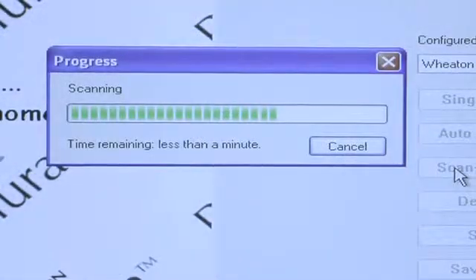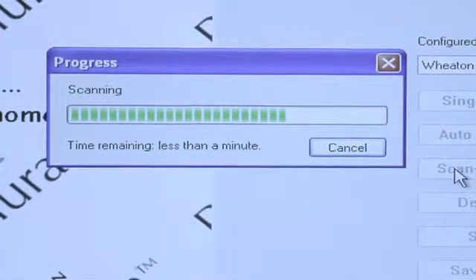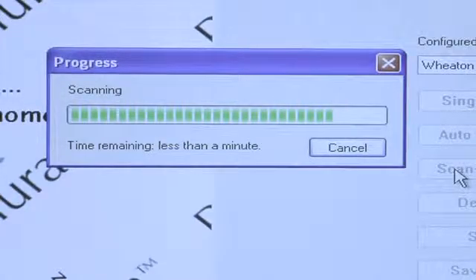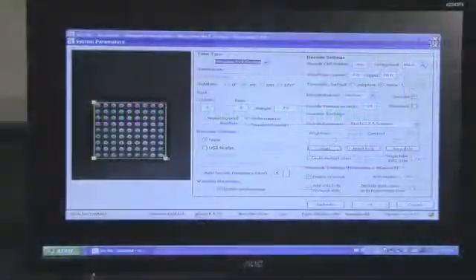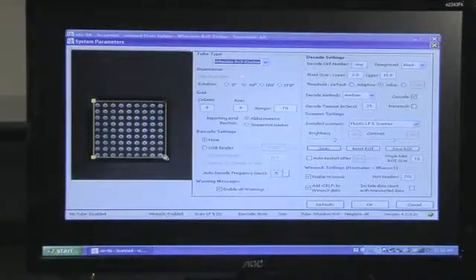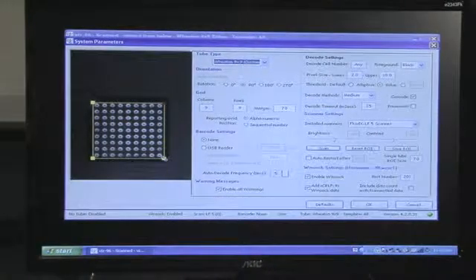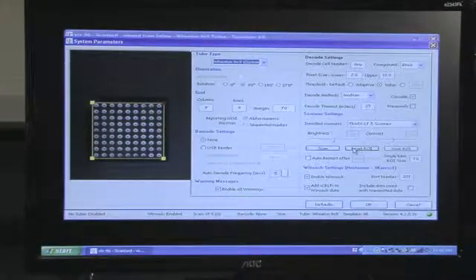The Wheaton Pluriscan will then perform a preliminary scan of the vials in the rack. Using your cursor, edit the size of the scan to the relevant area of interest.